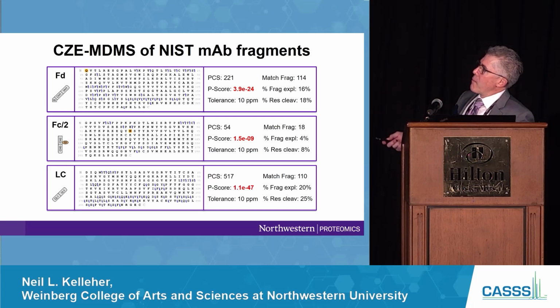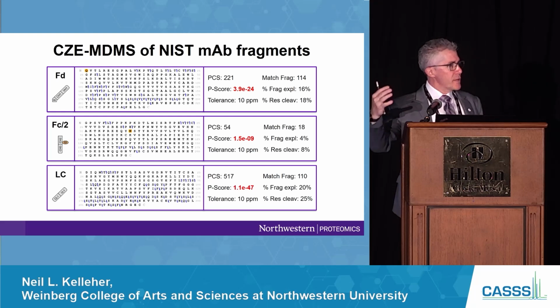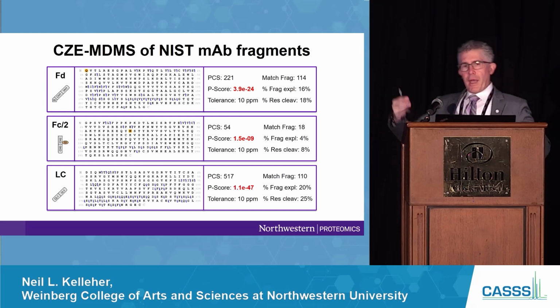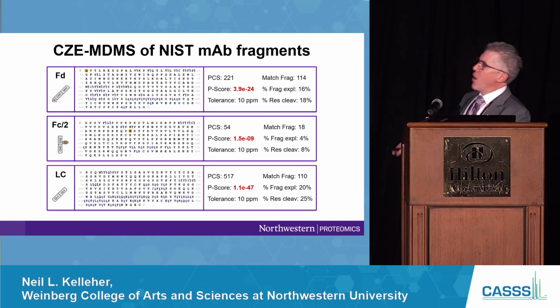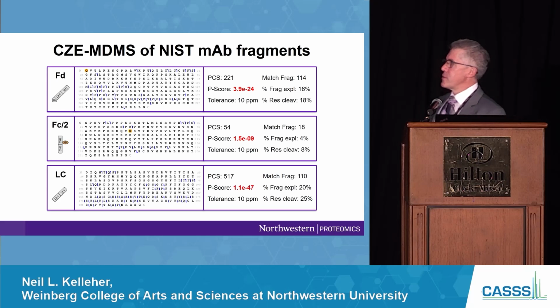Here's the amount of evidence that you can expect, I think actually expect, in this maturing method to localize, for example, the N-glycosylation site, or other sources of variance. And you look at this, and I had a lot of feedback 10, 15 years ago. It's like, oh, well, you're not getting this, and you're not getting that. You're not getting localization, right? You want single amino acid localization power if you have a modification or you have drugs bound to an antibody.